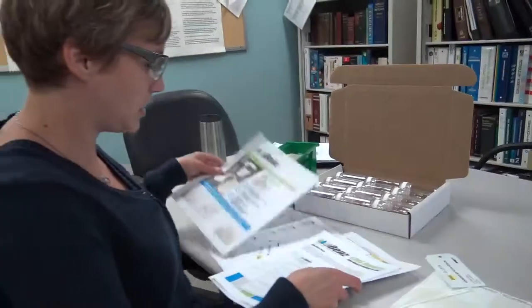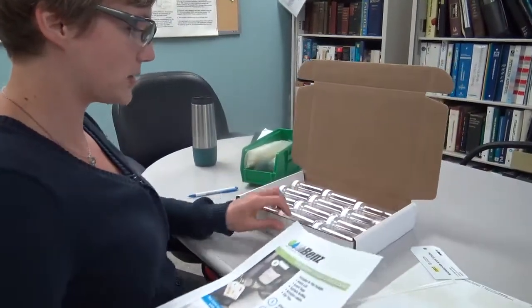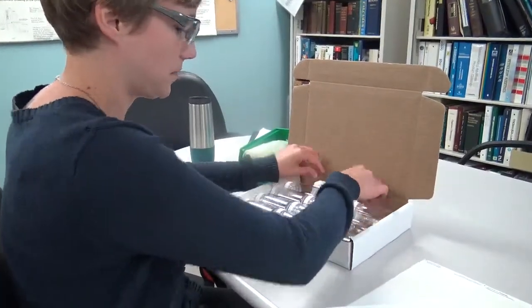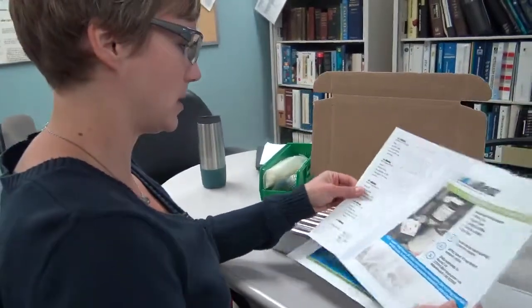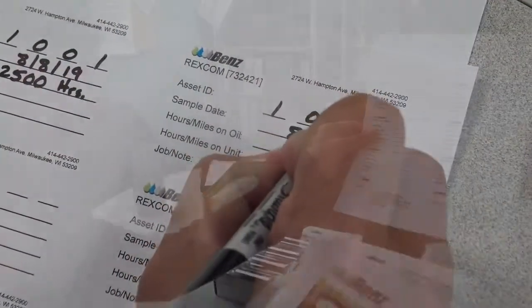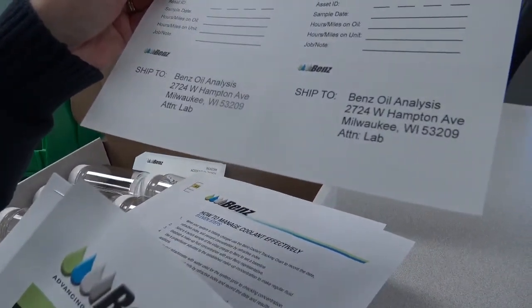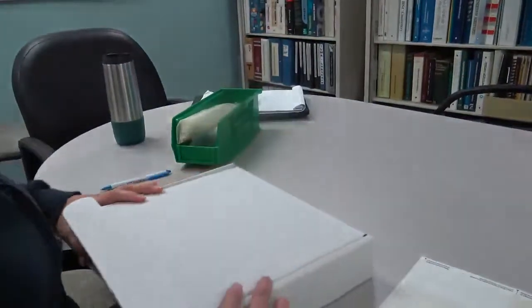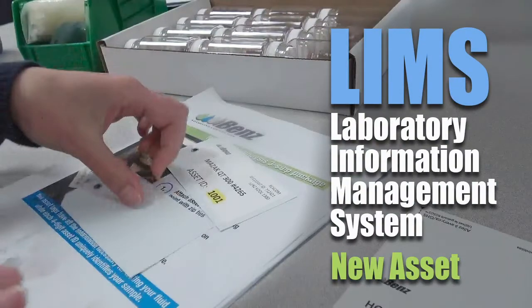So all of this information will be put into a box with some bottles. And then after sampling is done, the customer can also use the address label that's on the bottom of each sample label sheet. So all of this information will be put into a kit, and then we will mail this to the salesman, and then they can visit their customer and go through the different parts of the kit with them.